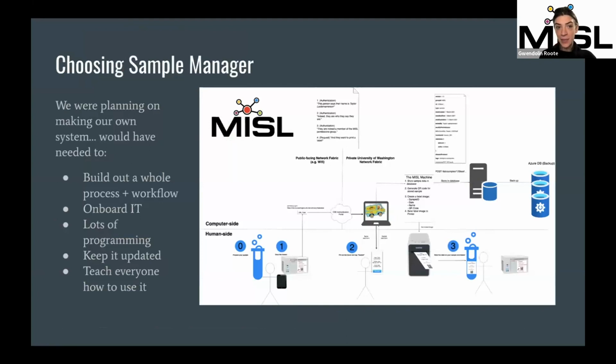So why do we choose Sample Manager? When I started, the previous lab manager had a plan in place for creating our own sample management system. And I came from a high throughput genomics lab in which we also had our own LIMS that we had built in-house. It was very fleshed out. It handled the ingestion of thousands of samples a day to do NGS sequencing for clinical data. And we had 3 full-time engineers working just on our sample management software at my last lab.